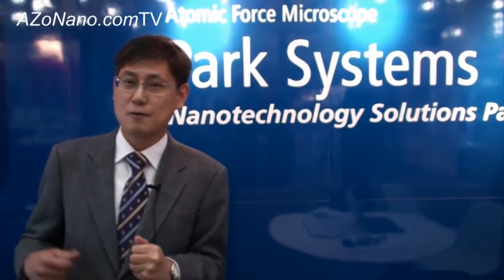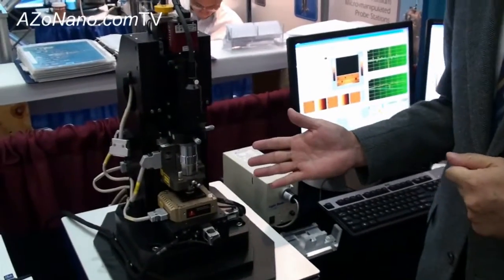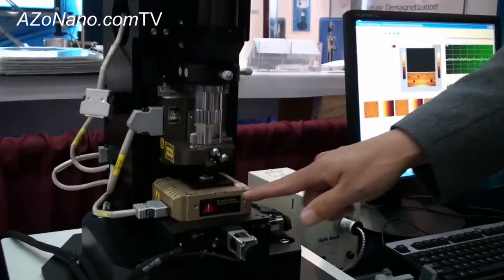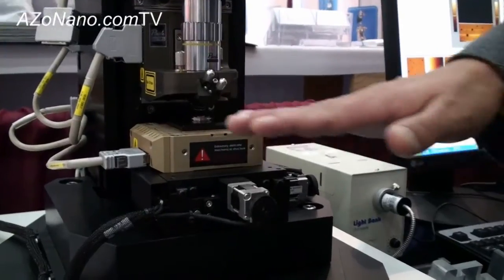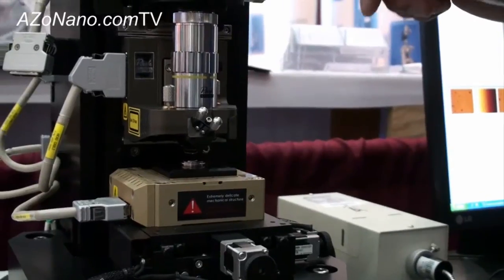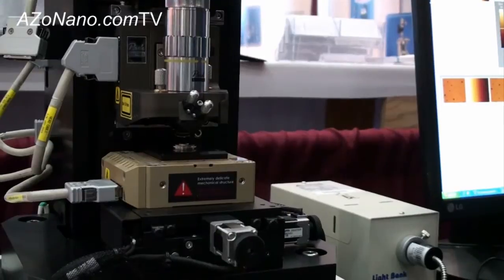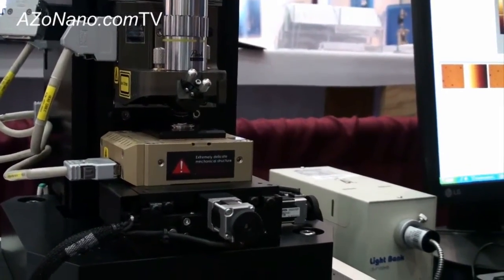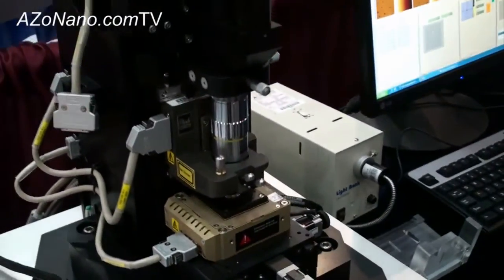Let me show you how our new AFM works. Our new AFM XZ100 has a very different configuration. We have a separated XY scanner which scans the sample in the horizontal direction only, and we have another Z axis scanner which moves the probe in the vertical direction only. In that way, we can achieve a very flat scan — the out-of-plane motion is less than one nanometer when we scan about 100 by 100 micrometers in X and Y.